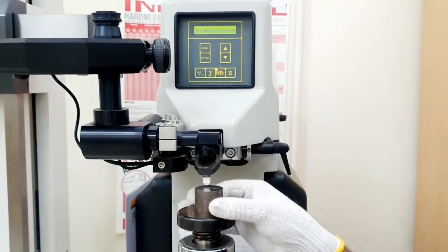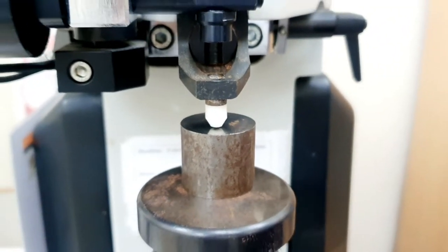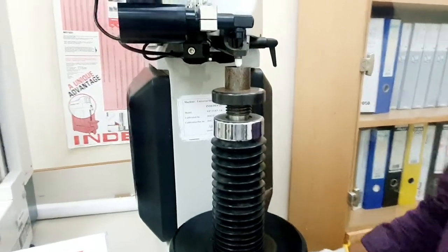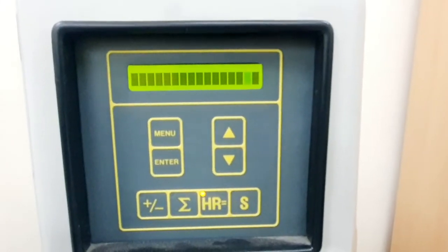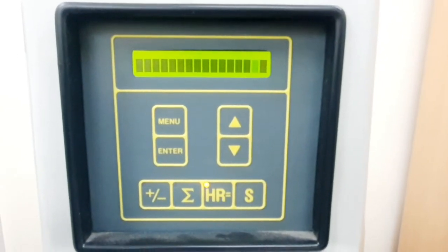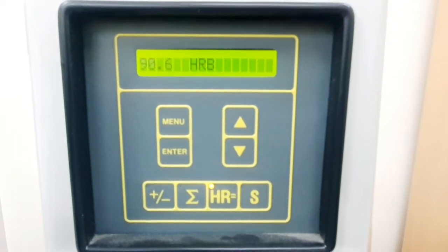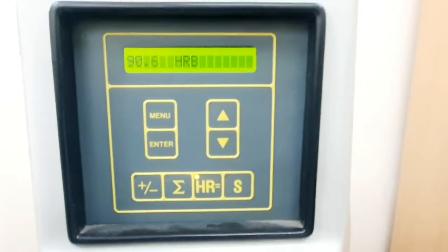After the first reading, we readjust the sample to make sure the indenter is in another position, and we will take the second reading. We rotate the table again until we hear the beep sound — yes, now the machine is ready. The machine automatically applies the load for 15 seconds and gives the hardness reading. The value is 90.6 HRB for the steel sample. This is the second reading.